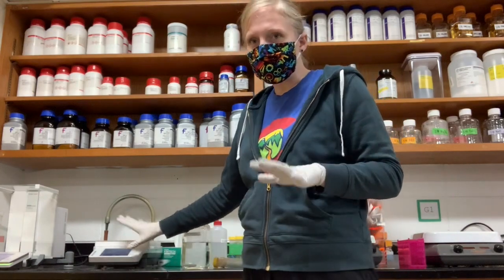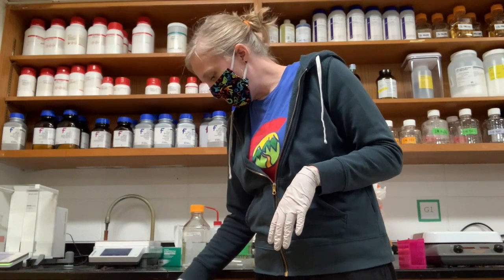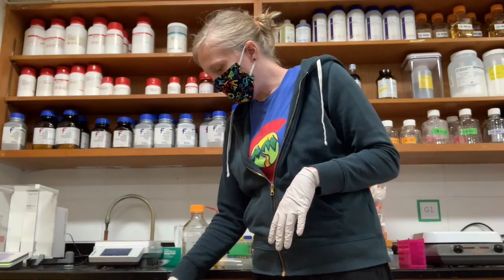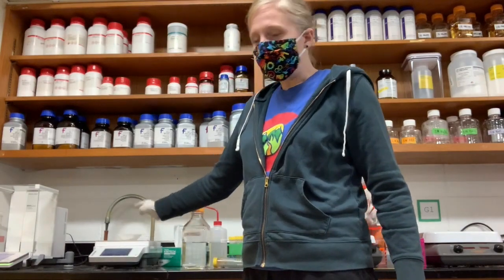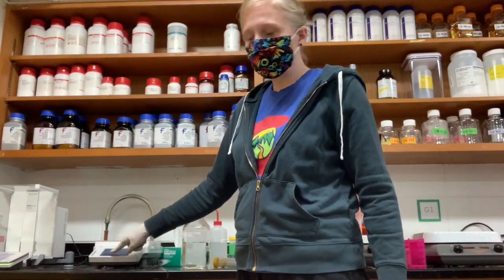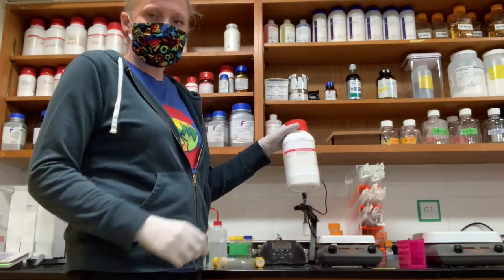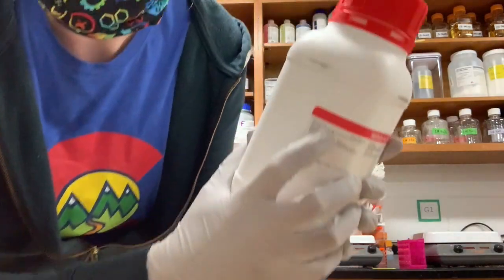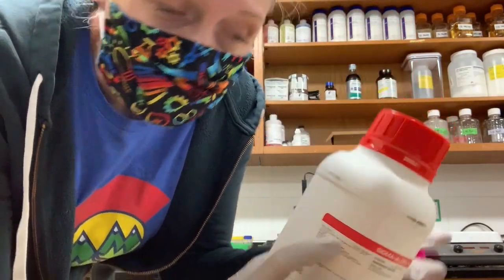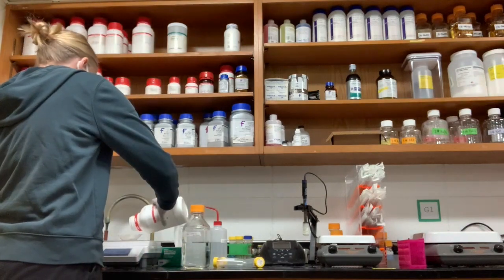So we have some weigh boats down here. I'm at the back chemical bench. Here's the scale. And right below the scale there are some weigh boats. So for example, you have 3 different sizes. They look like this. You'll put them on the scale and hit T for tare to make sure that it's zeroed. And then I've gotten out the ammonium acetate. I mentioned earlier in the video that there's a place where it gives you the molecular weight, so that's where I found that information. And I'm going to pour this out gently.